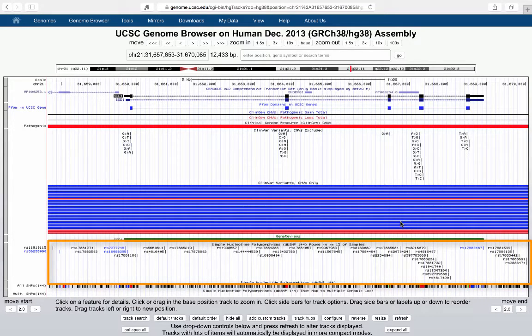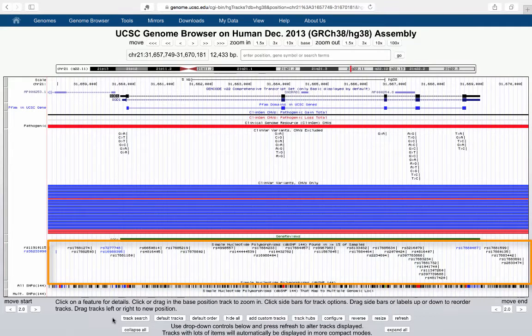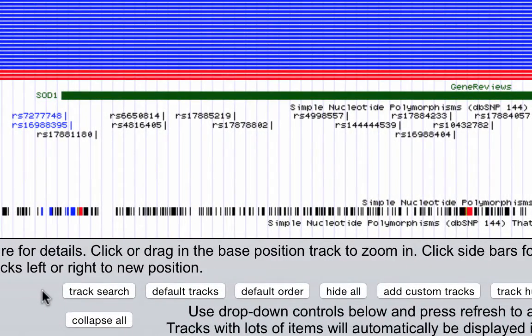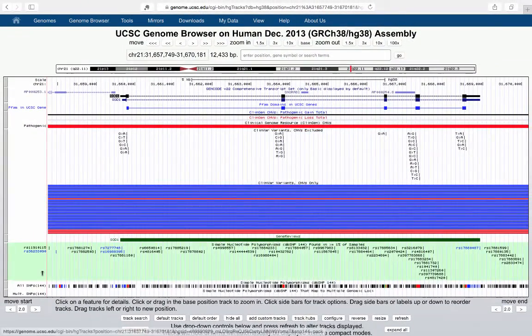There's a track called common SNPs. These are SNPs that have greater than 1% minor allele frequency. I have the dbSNP common SNPs track displayed in PAC mode, and you can see that each SNP has its RS number associated with it. Most of them are not colored — they're intronic — although there are some that are blue and are in the 3' and 5' UTR region. Below that, in dense view, I have the all SNPs track.